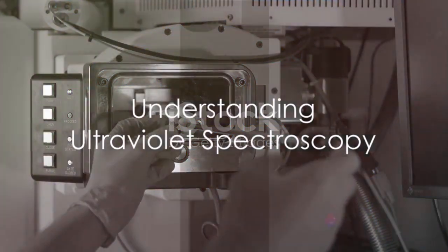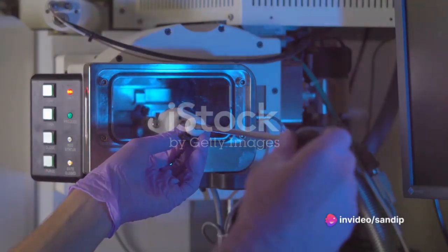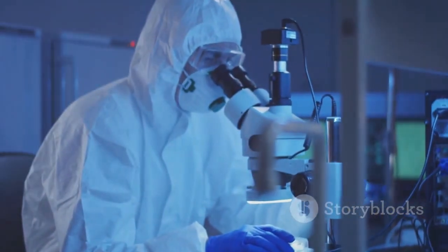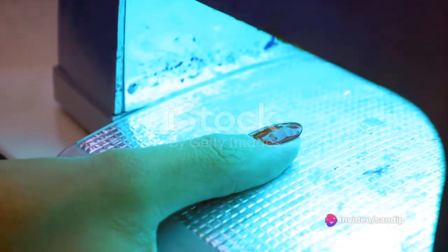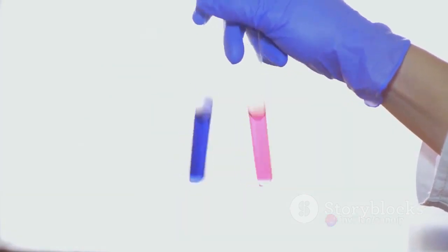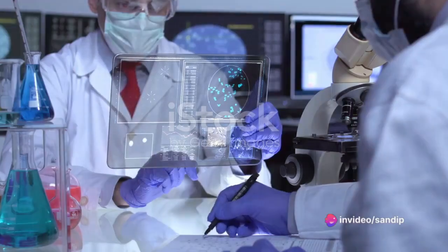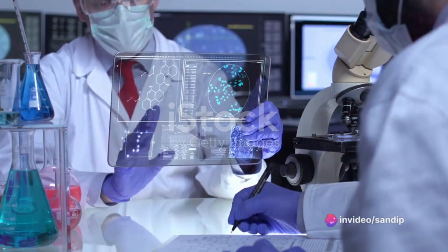Ultraviolet spectroscopy is a type of spectroscopy that uses ultraviolet light to study the structure and properties of molecules. It's like a detective tool for chemists, allowing them to identify unknown substances, determine the structure of molecules, and study chemical reactions. The process involves shining ultraviolet light onto a sample. This light has enough energy to excite the electrons in the sample's molecules. As these electrons absorb the energy and move to a higher energy level, they leave behind a unique pattern or spectrum. By studying this spectrum, scientists can glean invaluable information about the sample's molecular structure.